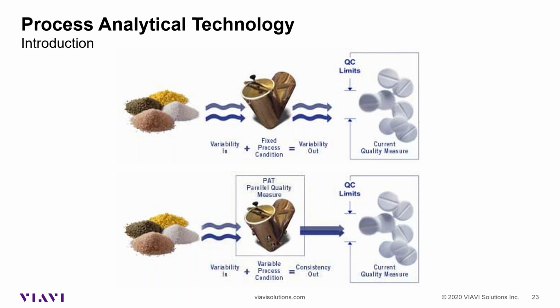But this is a very important point, a very important slide, because here we have on top our raw material, we have our process and our tablet at the end. The classical thing that we try to do is to keep as constant as possible the ingredient, the raw material, and this is correct. We can identify the raw material, we can only buy from a validated supplier and so on. But if we keep the process constant, it ends up that the output will be for sure variable, because the raw materials, even with all the endeavor that we can make, are variable by definition. So if a process is constant and not known, it ends up that the final product will be variable and unexpected.